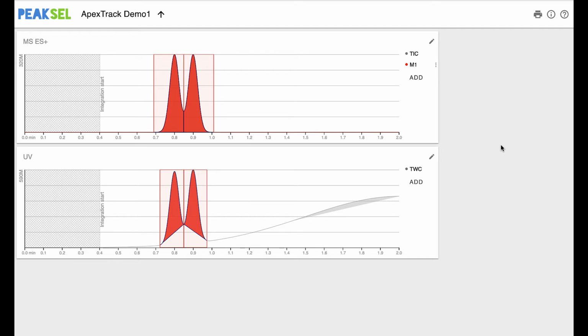Two similar situations, but in one case the baseline is determined correctly, while in the other case, well, you can see this embarrassment yourself. So what's happening here? You may not see this well, but these peaks don't actually touch, and therefore they don't form a cluster. So the baseline for each of the peaks is drawn separately.